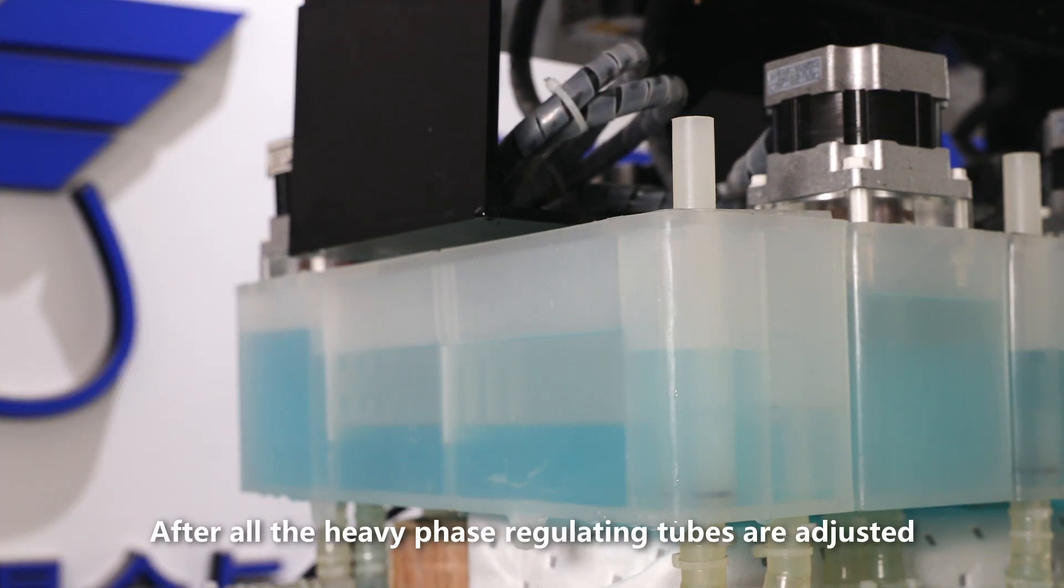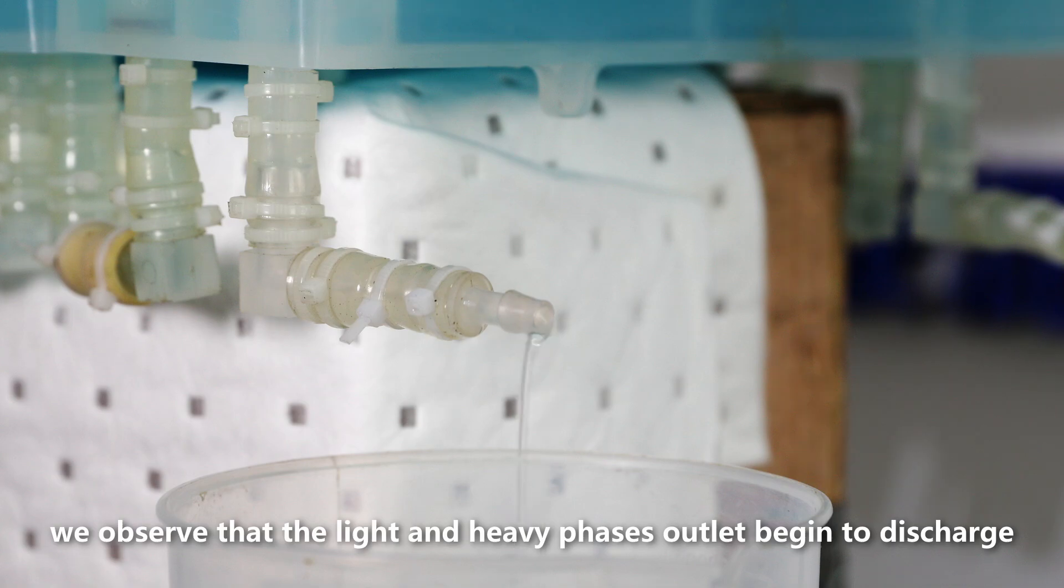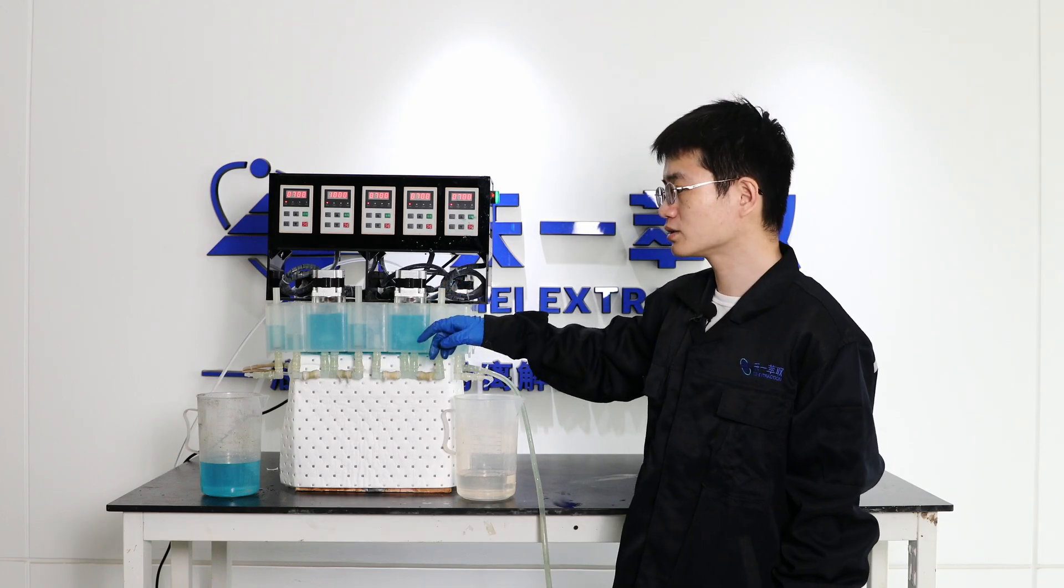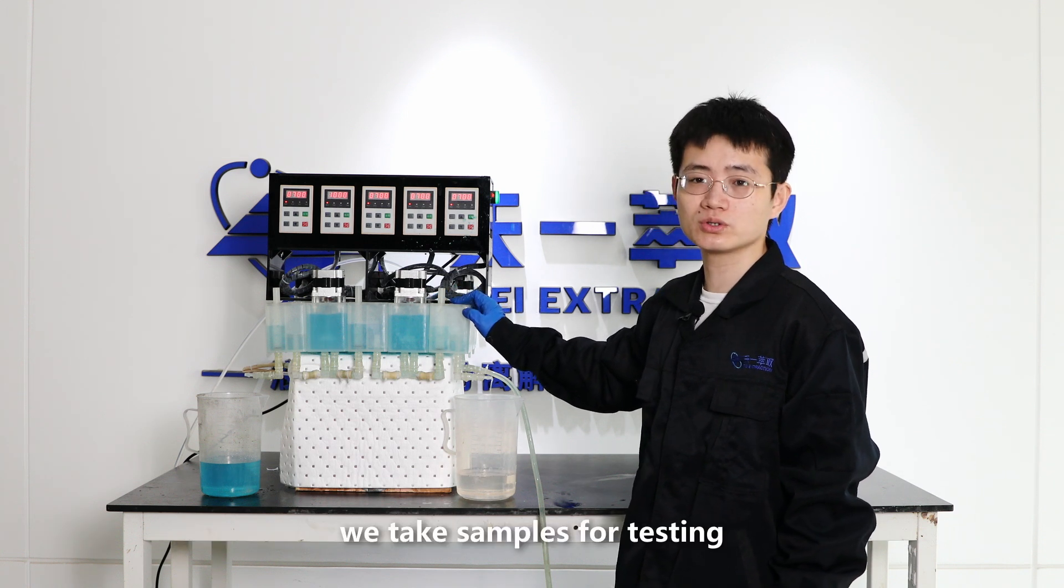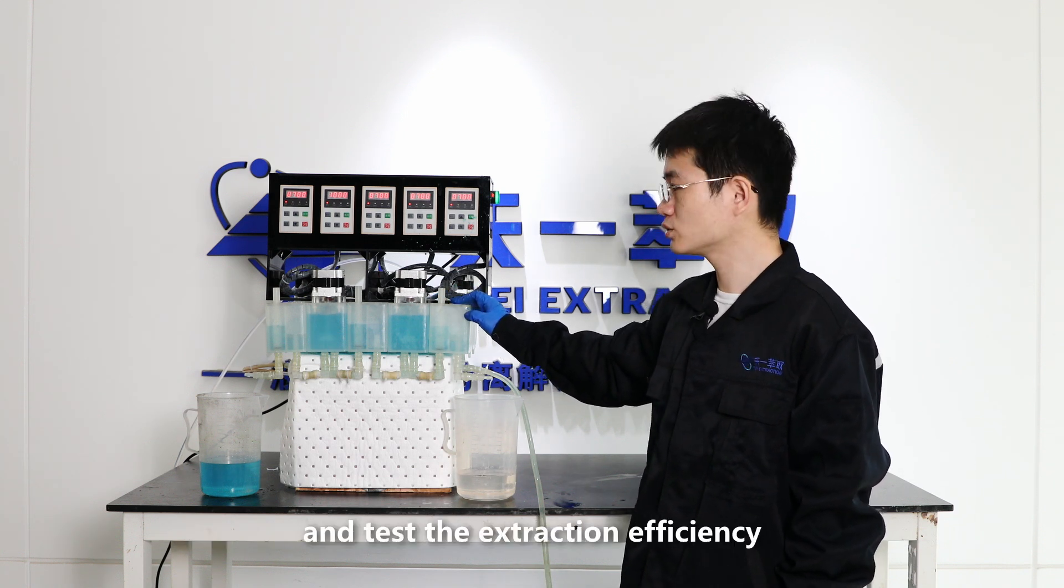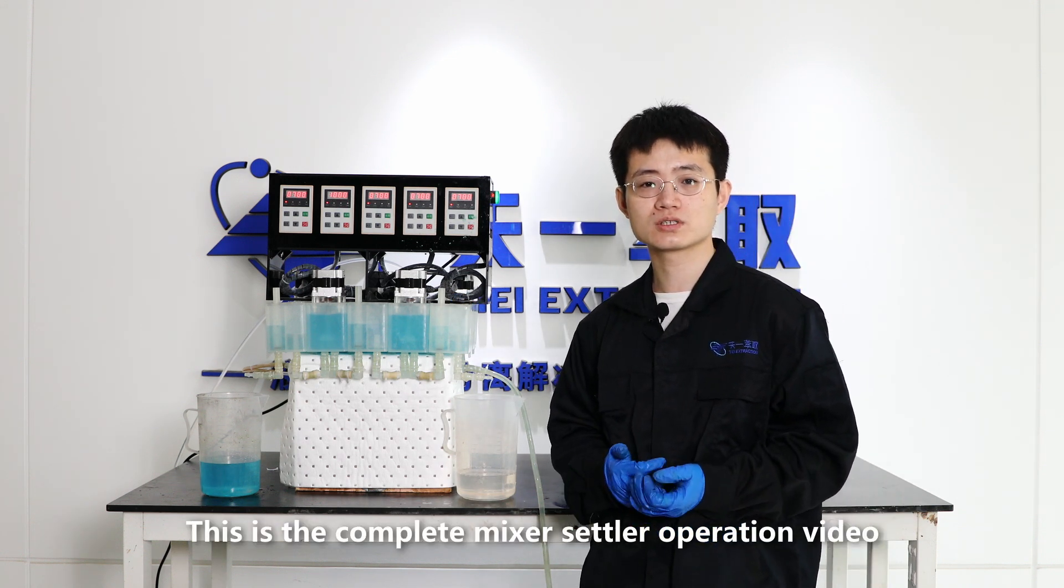After all the heavy phase regulating tubes are adjusted, we observe that the light and heavy phases outlet begin to discharge after the operation has stabilized for a period of time. We take samples for testing and test the extraction efficiency. This is the complete mixer settler operation video.